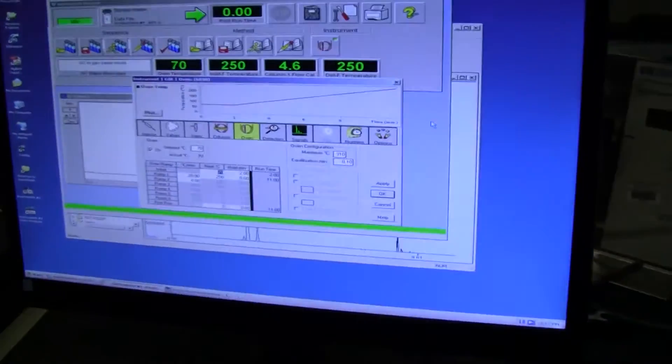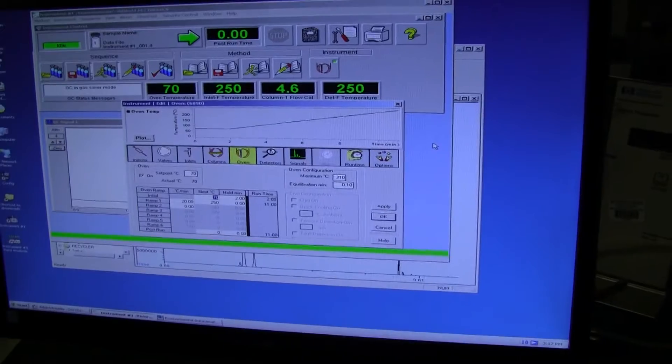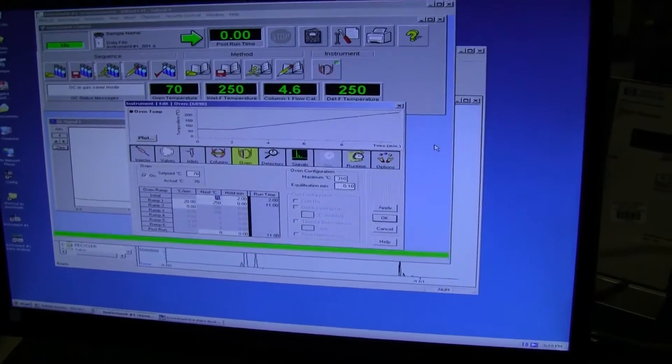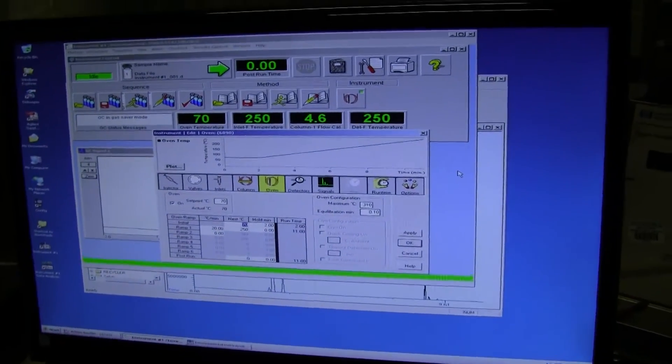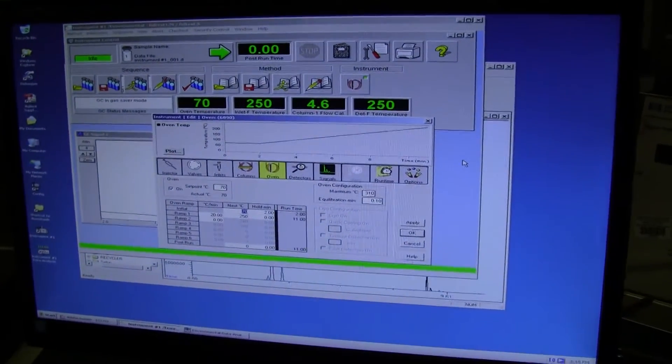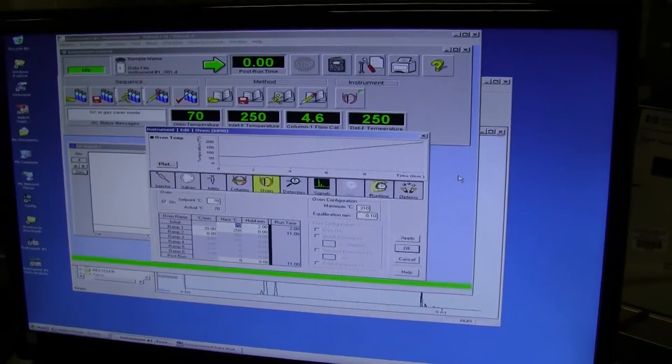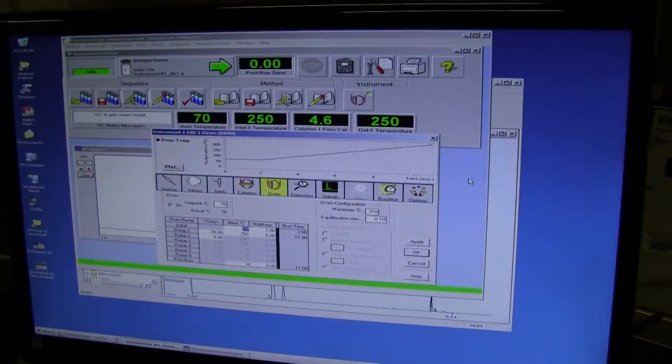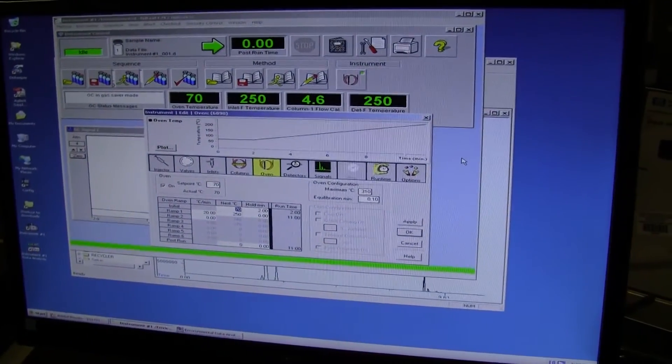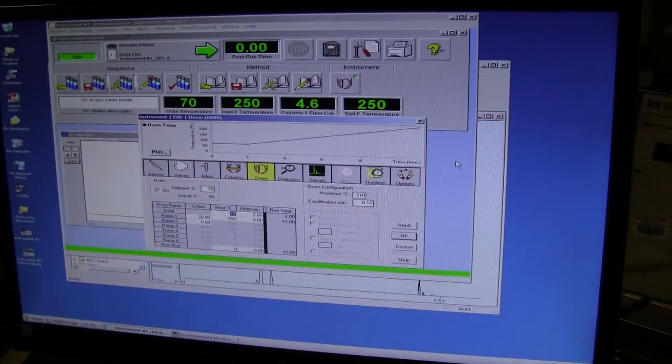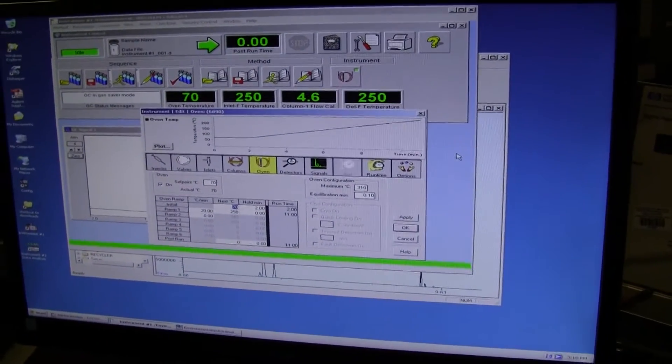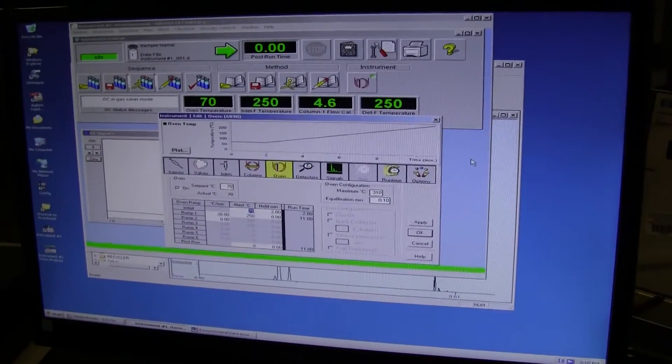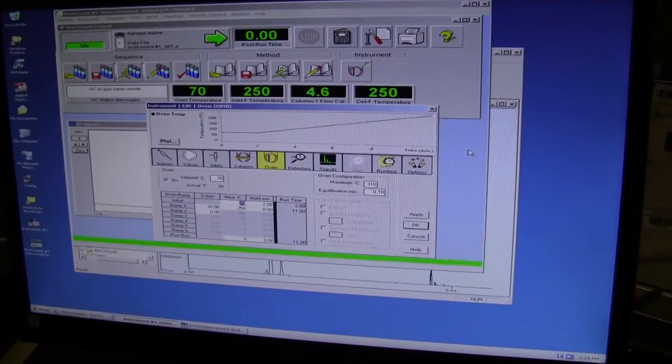Today we'll be demonstrating a little bit of the Agilent ChemStation DA software. What's important to note about this software, it is the GCMS software. The GCMS software does provide the capabilities of running a standalone GC or a full-blown GCMS system.